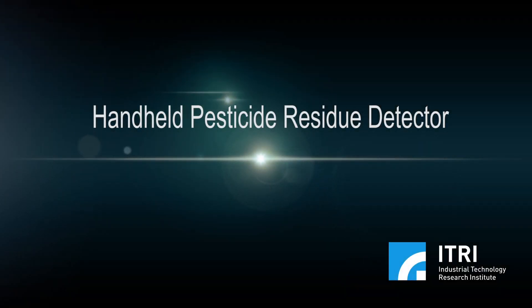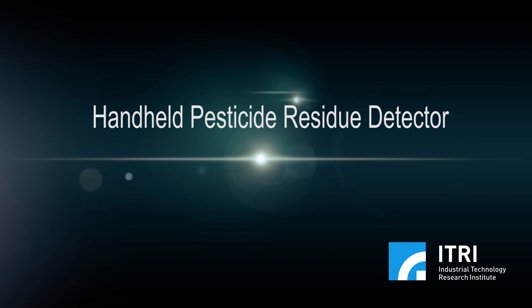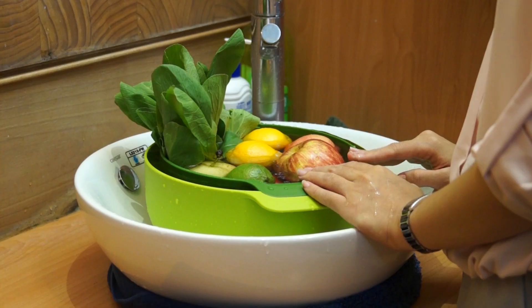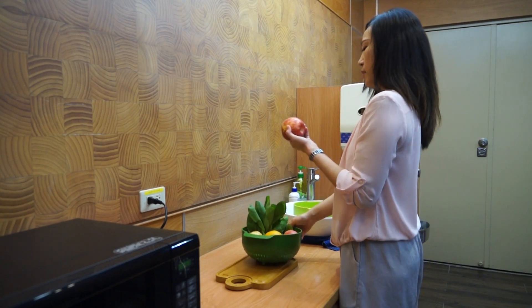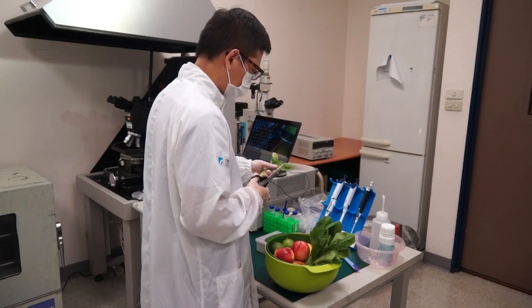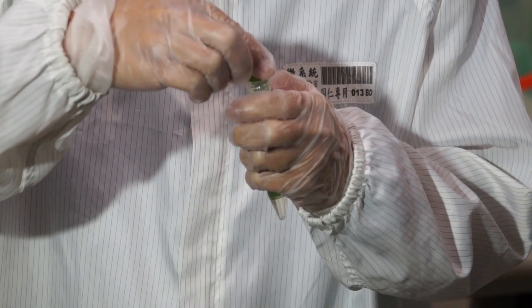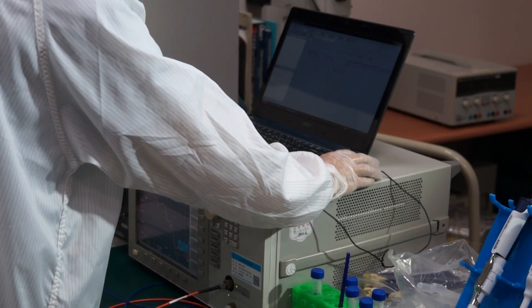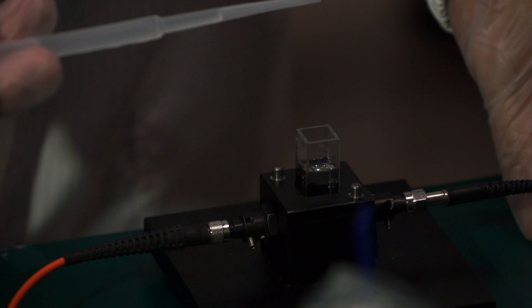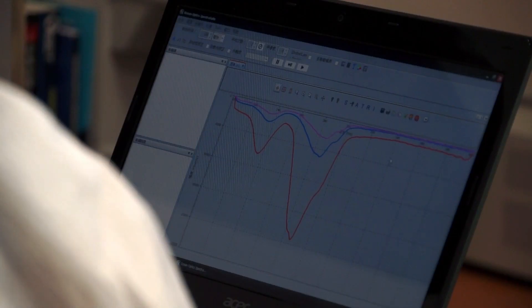Handheld pesticide residue detector. Pesticide residue on fruits and vegetables has long been an issue of concern. Current pesticide residue tests mostly entail a complicated process by using a huge spectrometer, and the test results take up to 30 minutes to produce.